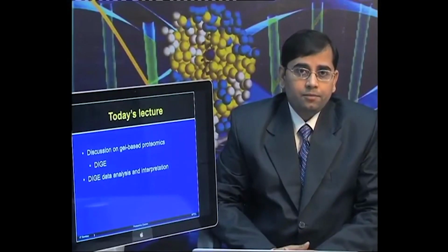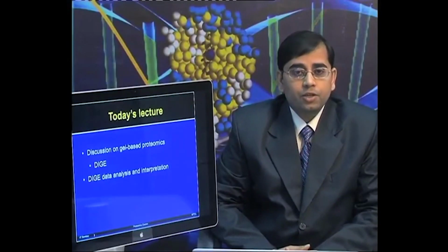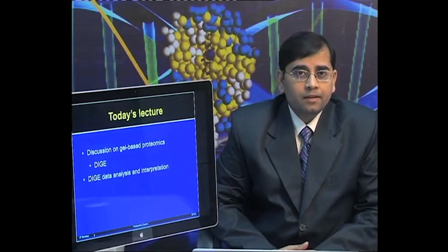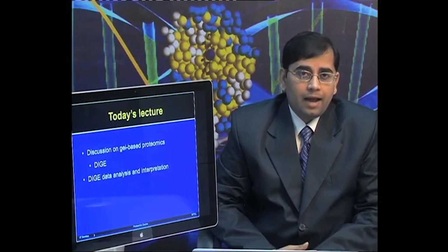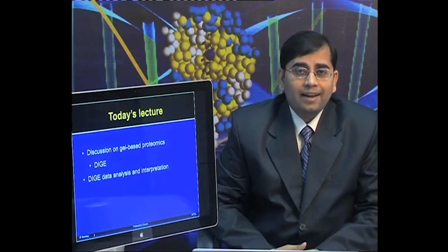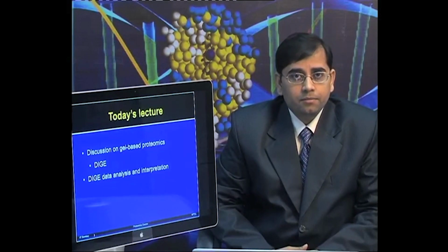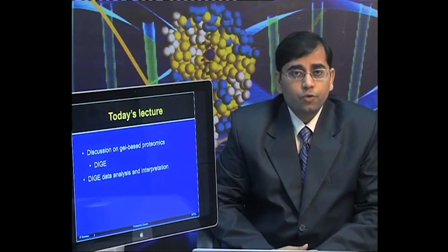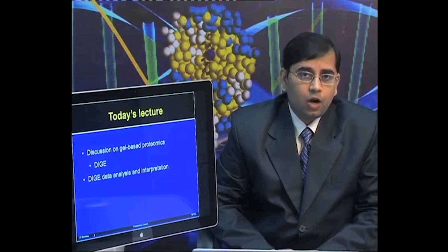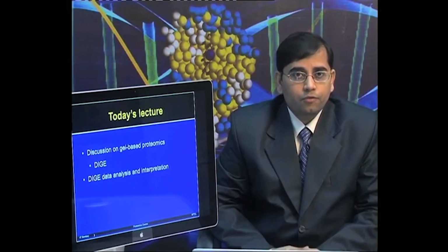So, in today's lecture, we will continue our discussion on gel based proteomics, certain advantages and challenges of performing DIGE experiments, how to analyze DIGE data by using a few very specialized software, and how to interpret that data, how to obtain some meaningful biological information from those analyses.